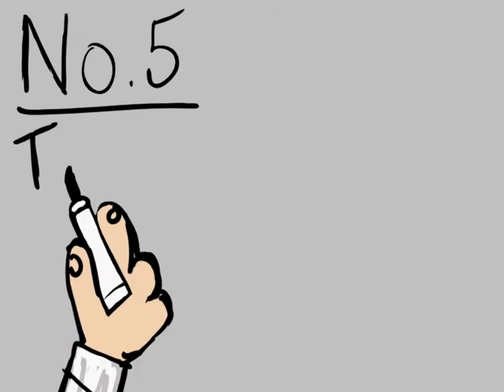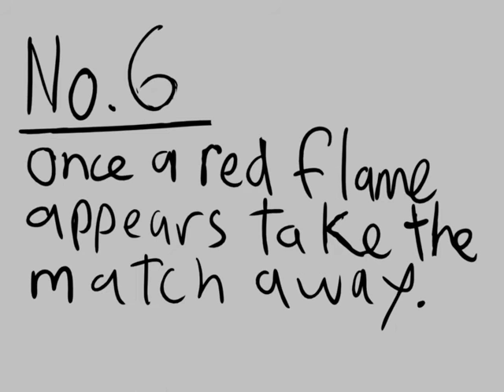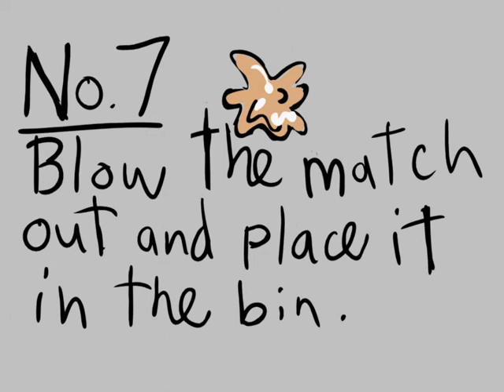Number 5: With care, turn on the gas tap fully. Number 6: Once a visible red flame, called the safety flame, appears, take the match away. Number 7: Blow the match out and place it in the bin.